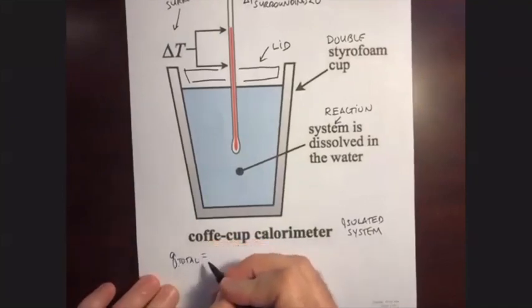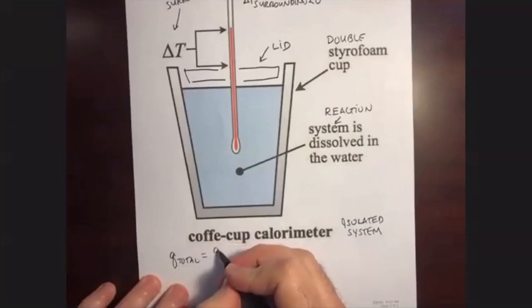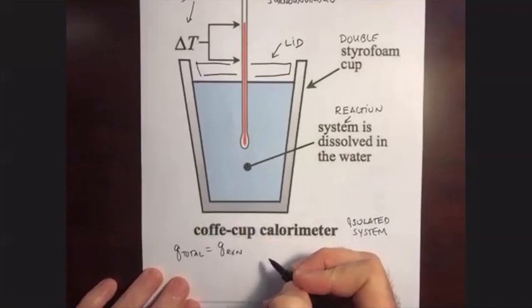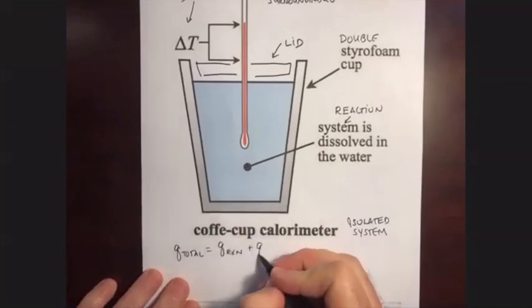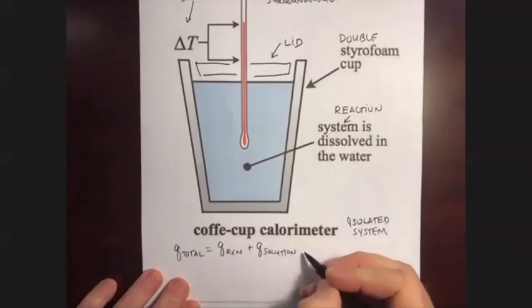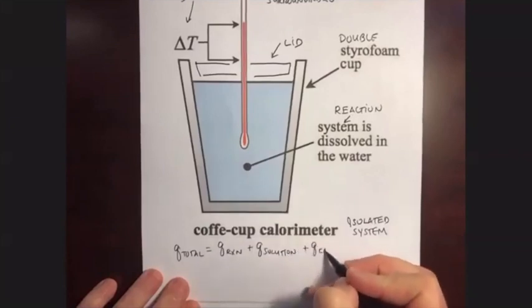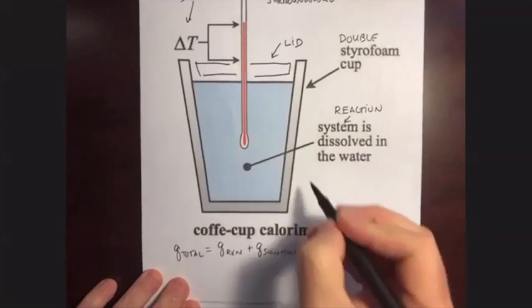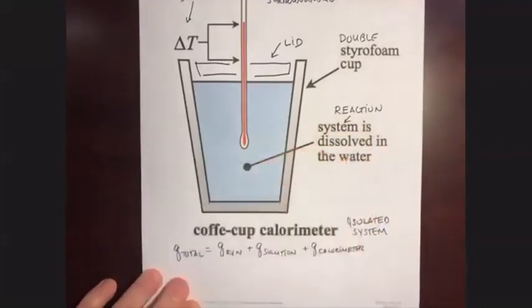Well, it would be whatever heat the reaction exchanges plus whatever heat the solution exchanges plus whatever heat the calorimeter itself exchanges. We have to include the calorimeter because the interior of the calorimeter is in contact with the solution and capable of exchanging thermal energy with it, right?